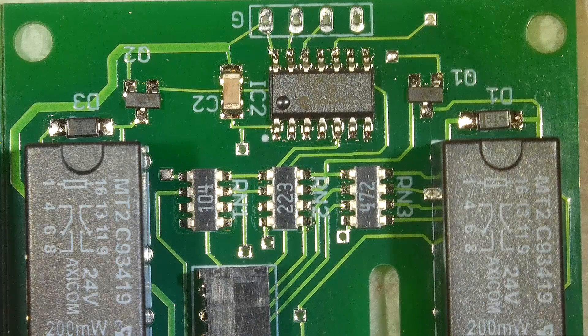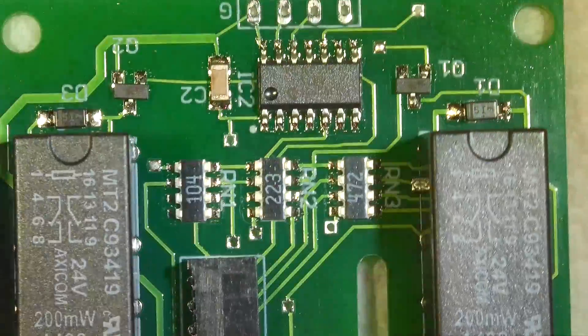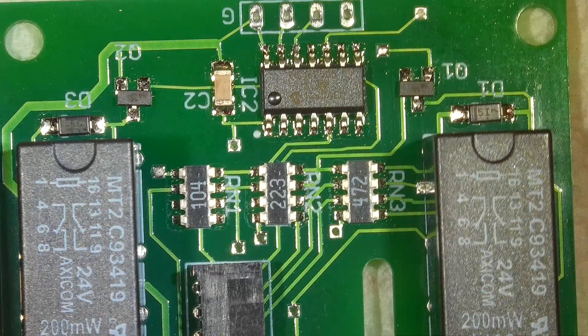Right now I am showing you what something might look like just shining the lights on it. Here's the left light and the right light. This is what it looks like with the reflections unpolarized.